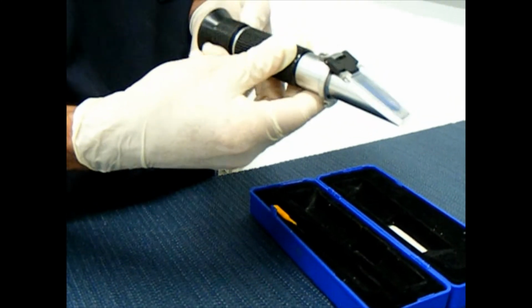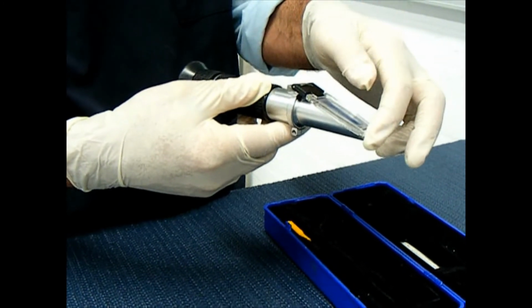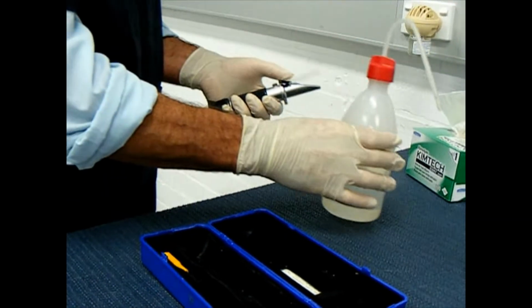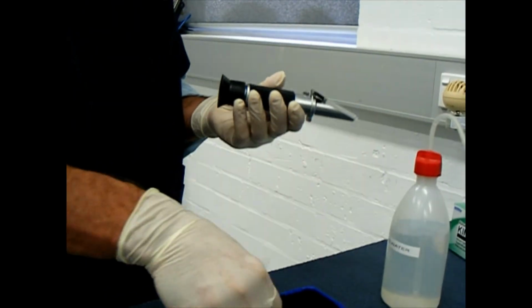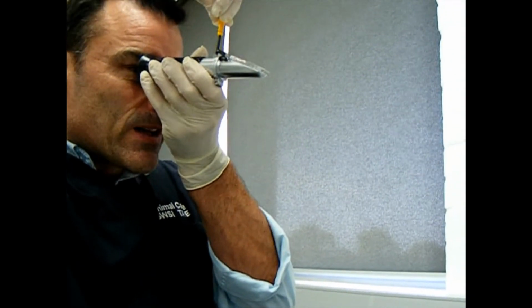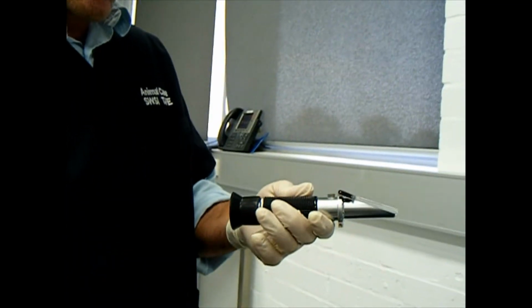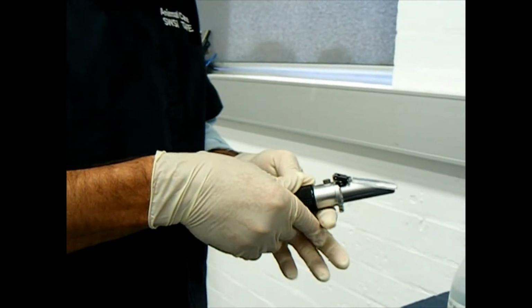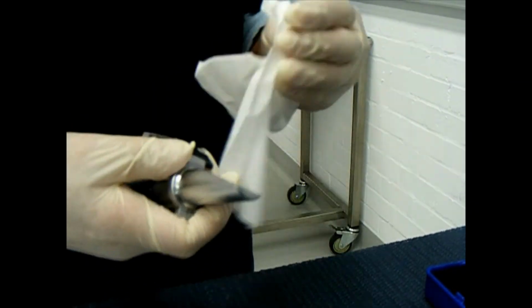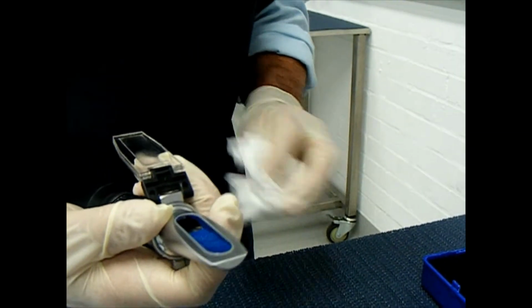Remember, this is the focusing dial here. This is the glass pane, and this flap comes down on top of it. First thing we do is we get some distilled water. We put the distilled water on and we calibrate. So to calibrate, you look down and you put the scale onto the bottom of the urine scale. So I spin that around, and so calibrating it, it's on the 1.000 on the urine scale. Now that that's calibrated, I have to get rid of this distilled water and make sure the refractometer is dry before we begin. So I use lint-free tissue to clean the refractometer and make sure it's dry.